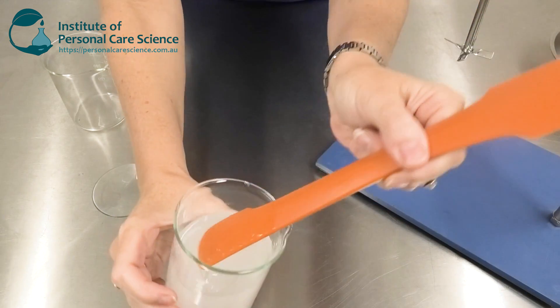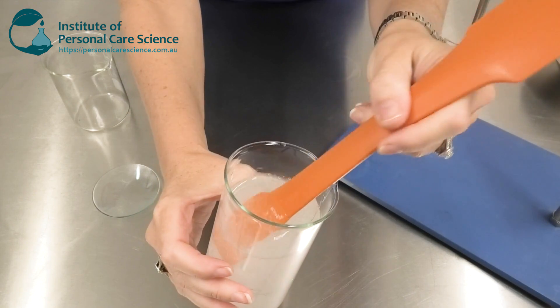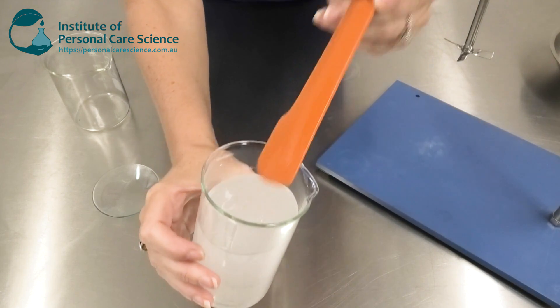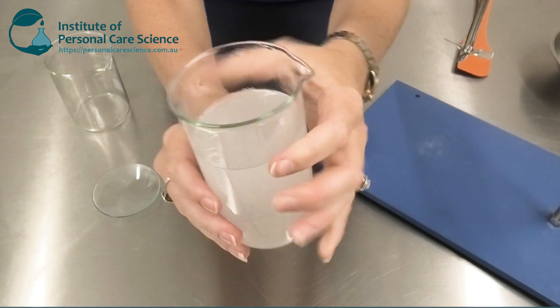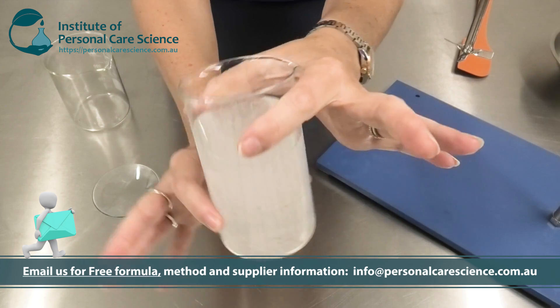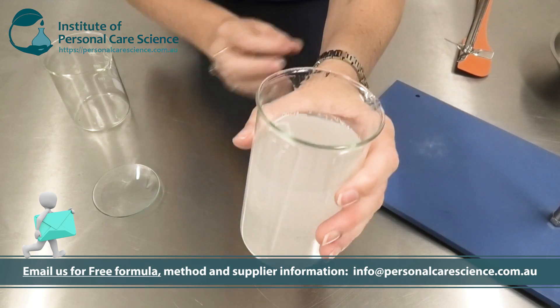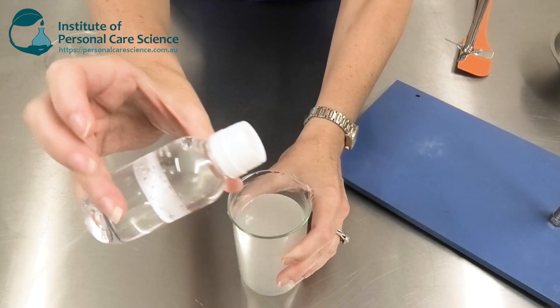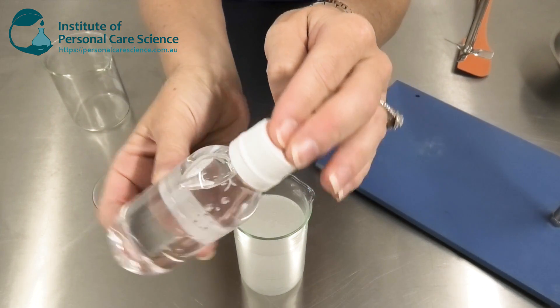And here we have our beautiful organic hand sanitizing gel. As mentioned, this is the viscosity on the day we make it. The pH comes out between 6 and 7 so we don't need to adjust it. Once the bubbles have settled out and the xanthan gum has fully hydrated in the gel network, we end up with this beautiful viscous and clear product. And there you go — that's how to create an organic hand sanitizing gel.